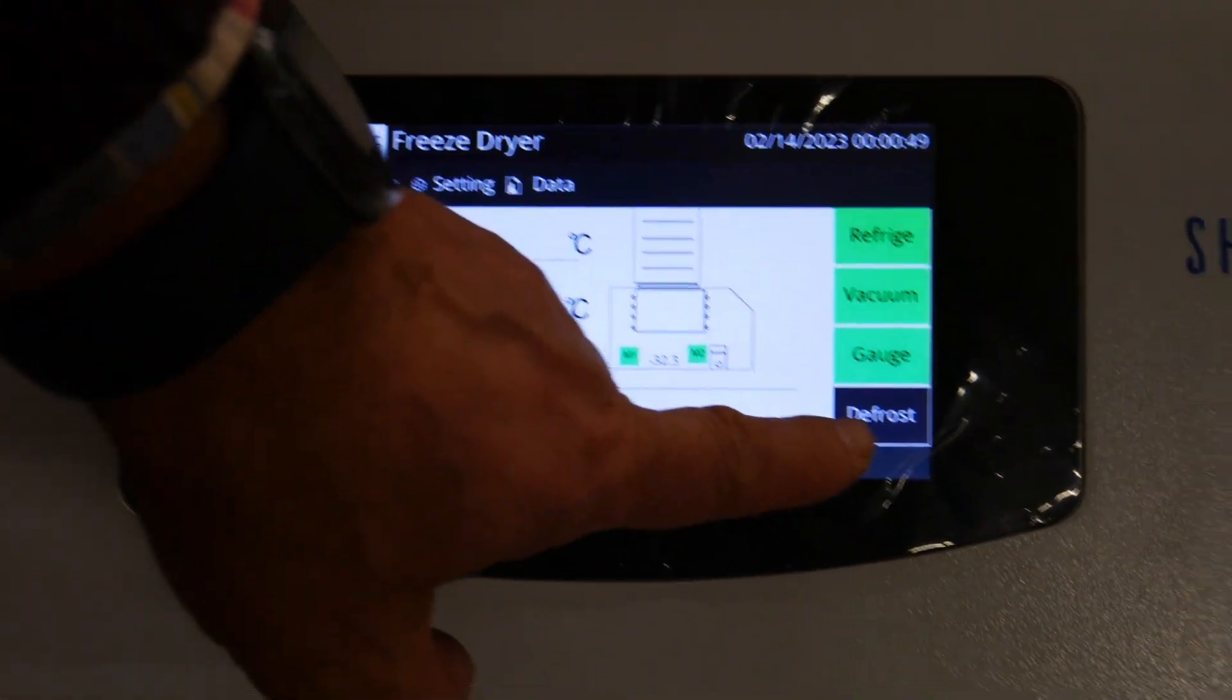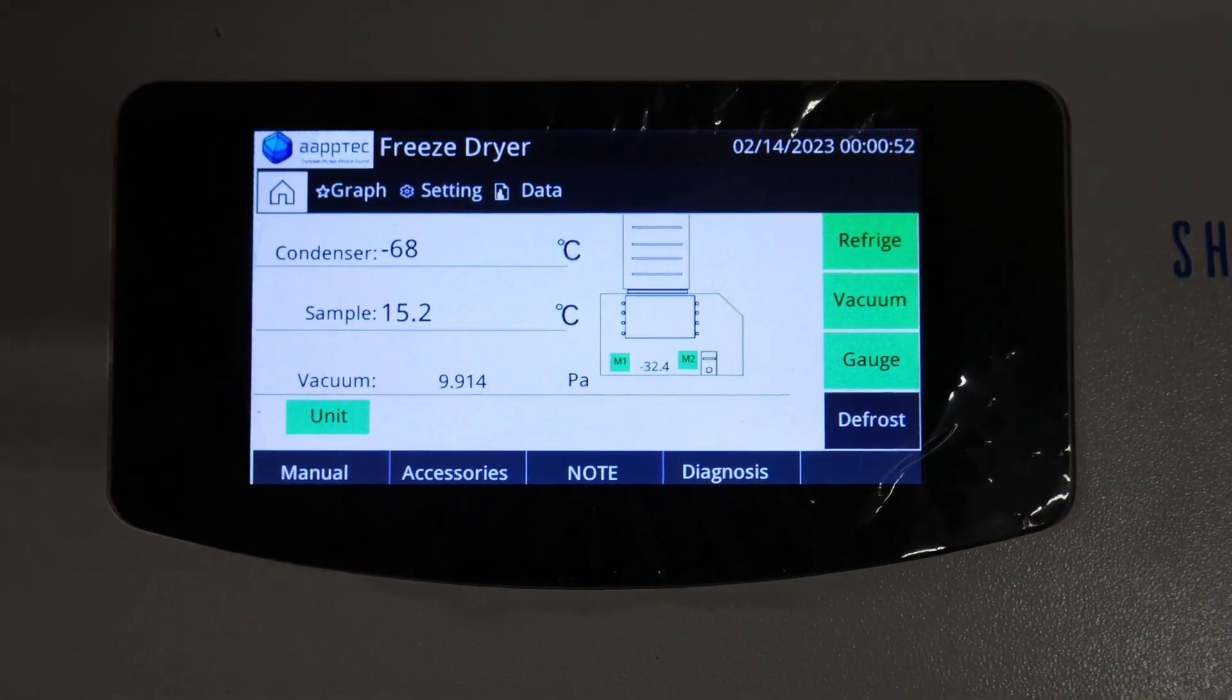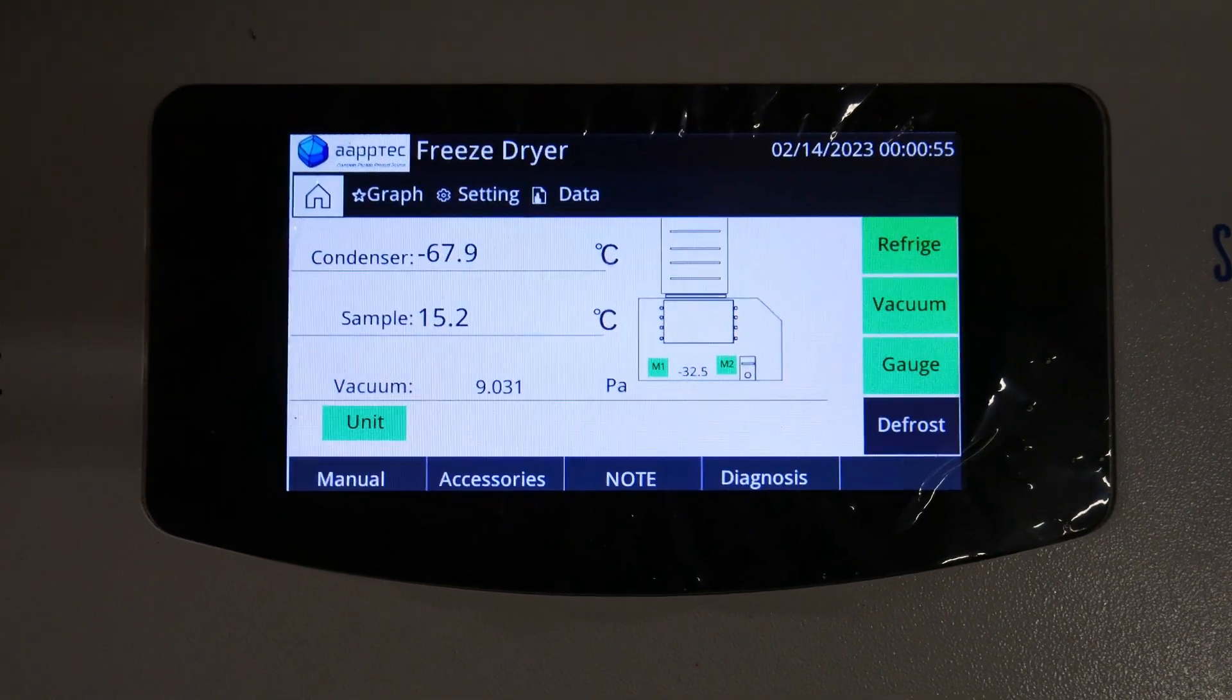The SharpFreeze system also provides automatic defrost. Just press defrost, and it is automatically done for you.